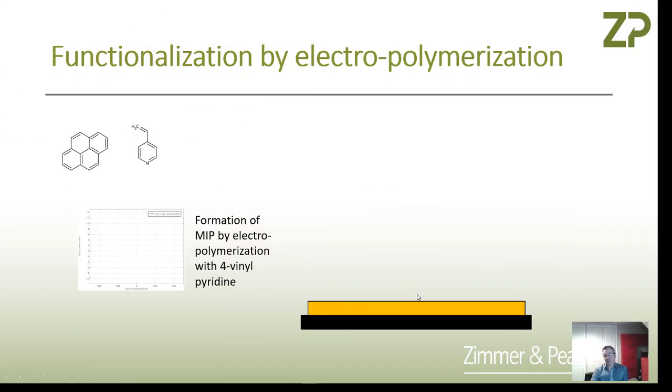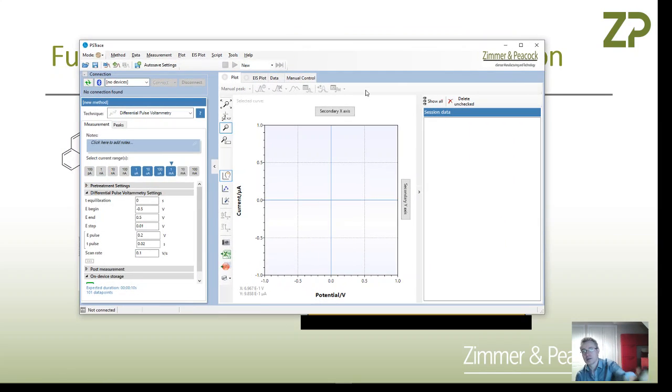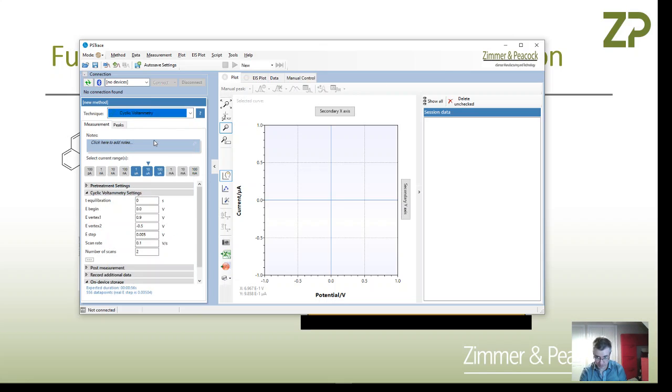He's got 4-vinyl pyridine and pyrene in solution, and he's using a technique called cyclic voltammetry. The nice thing about electrochemistry is we've got such a host of techniques. This software drives potentiostats like this, and you can just choose cyclic voltammetry and set the parameters to do the polymerization.